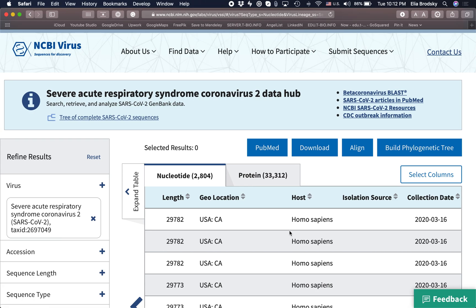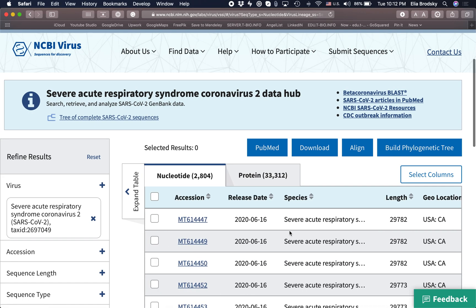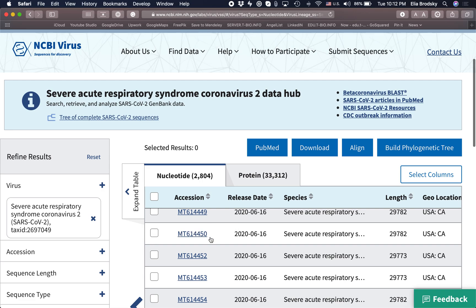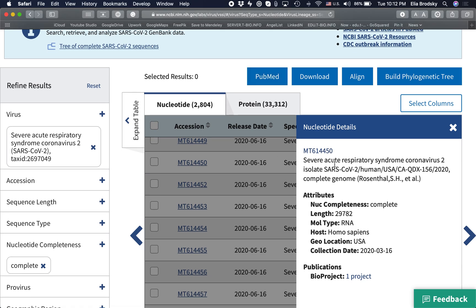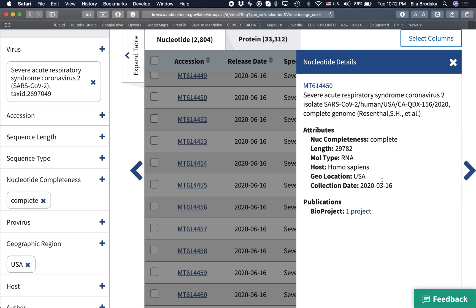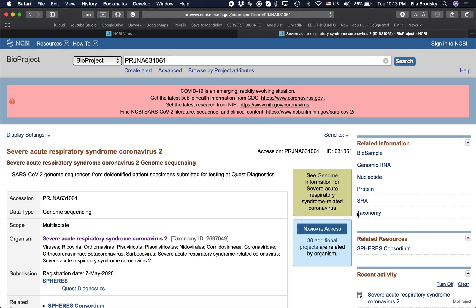If you scroll through the different available metadata, you'll see that each one has an accession number. If you click on the accession number, you can read more about where this novel coronavirus was collected from, which host, and the location — for example, USA, California. You can also see when it was submitted, the collection date, length, and more.